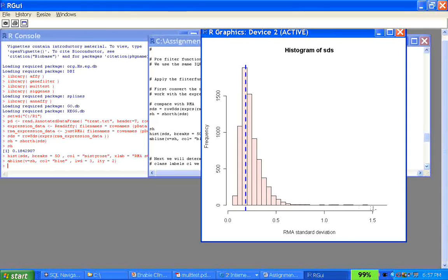So greater than 0.18 means higher. 0.18 is the threshold where roughly 50% of them are on the left side and another 50% are on the right. So you establish this criteria. Now your subset is going to be only those that I'm circling here to the right. This picture is worth 1,000 words. These are the subset that's going to be out of your 7,000.